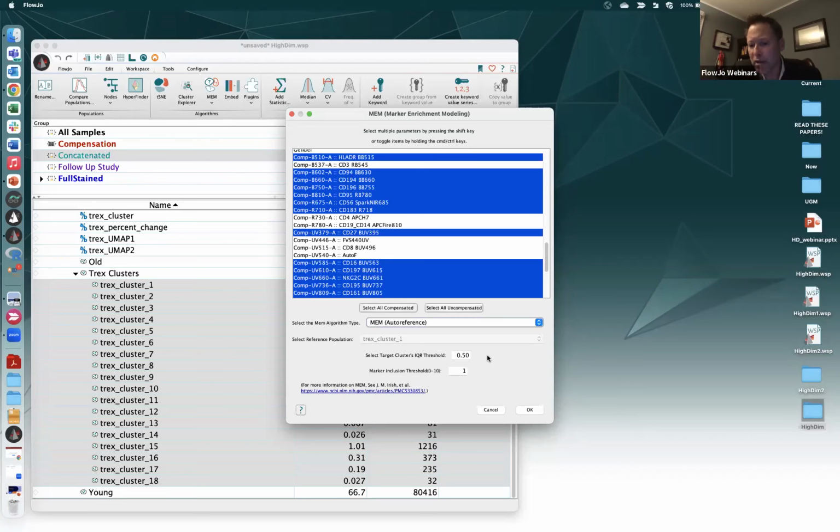If your question is more like, how do I turn that into a p-value or something like that? P-values are usually used to talk about how repeatable that is. If I had a plate full of data, 96 wells, half of them old, half of them young, and every single time a given population had more overexpression for young or old, you'd say with very high confidence this is repeatable because it happened 48 out of 48 times.